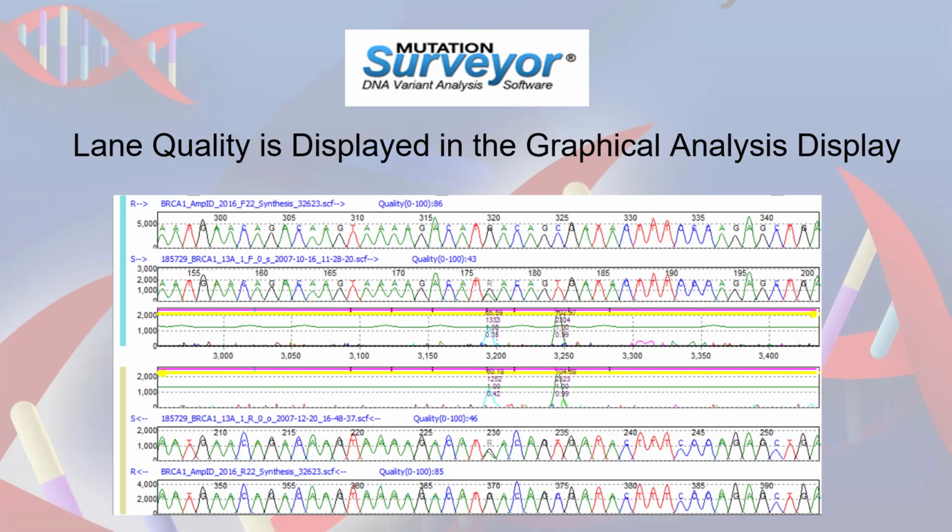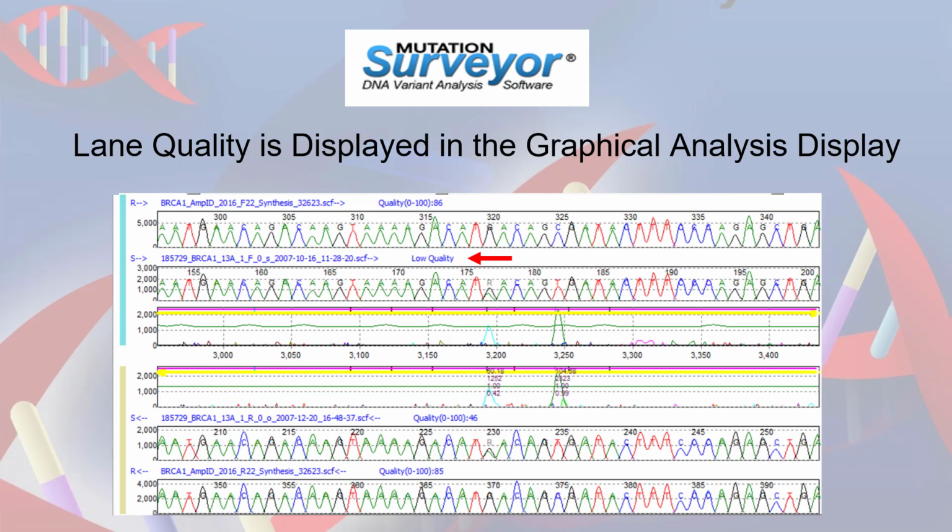The lane quality is displayed in the electropherogram pane of the GAD, above each trace and to the right of the trace name. A lane can be deleted by selecting the Delete Lane option from either the Mutation Table context menu or from the Sample Trace Name context menu. The lane quality for a deleted lane is set to low quality. All of the mutations for the deleted lane are removed from the mutation table.